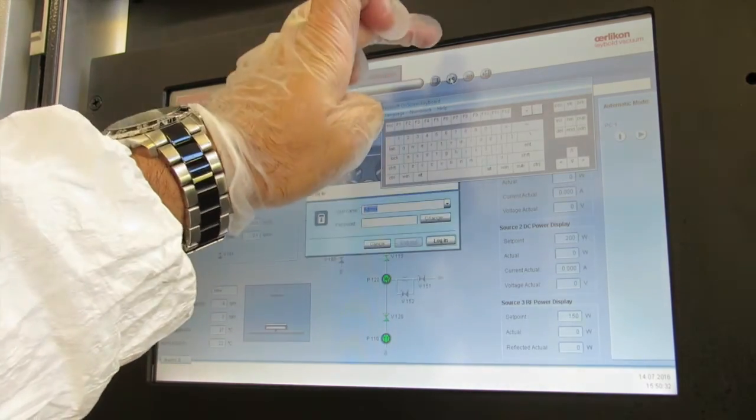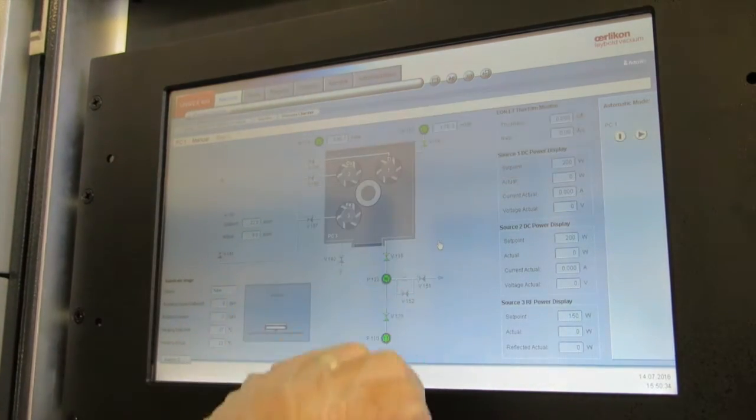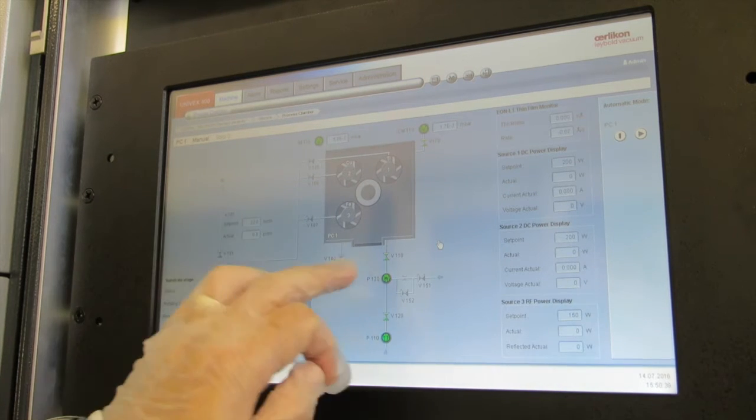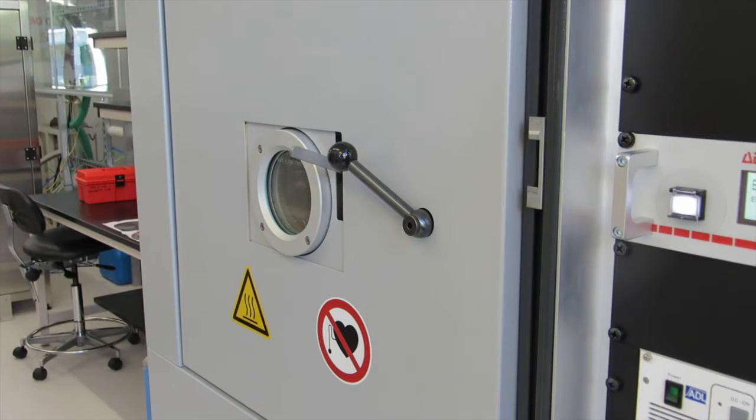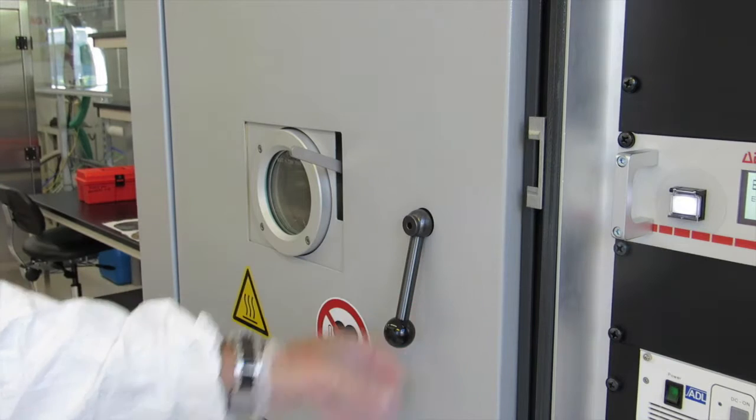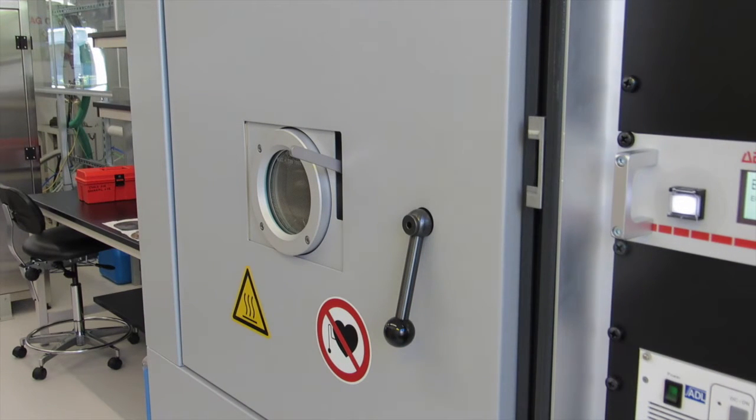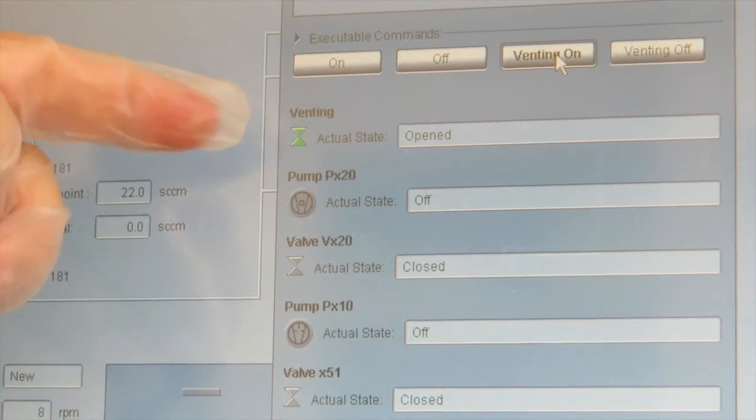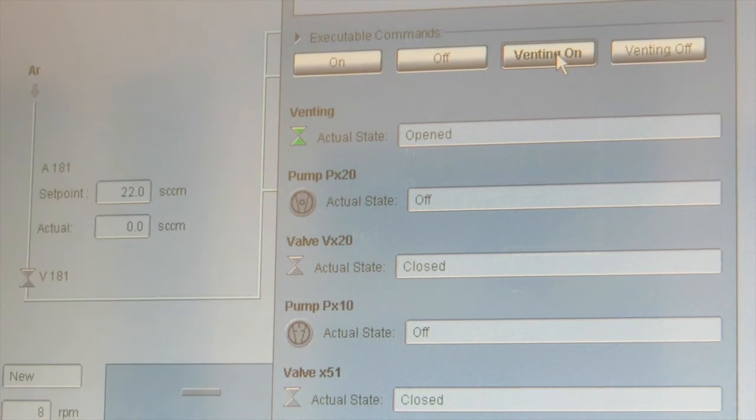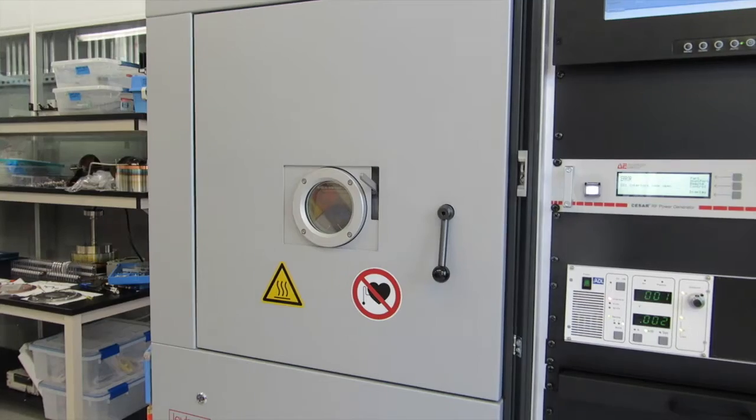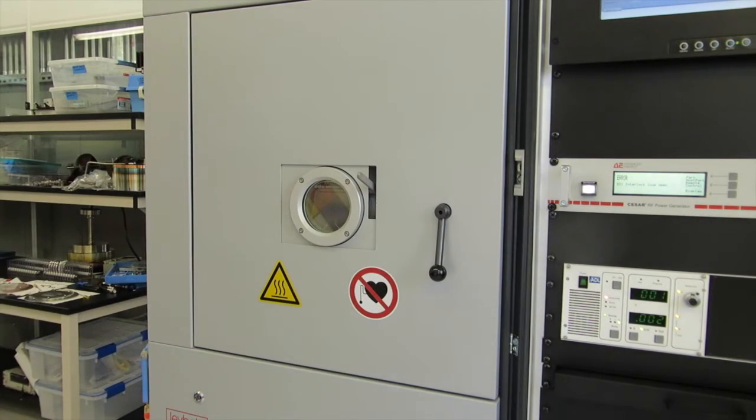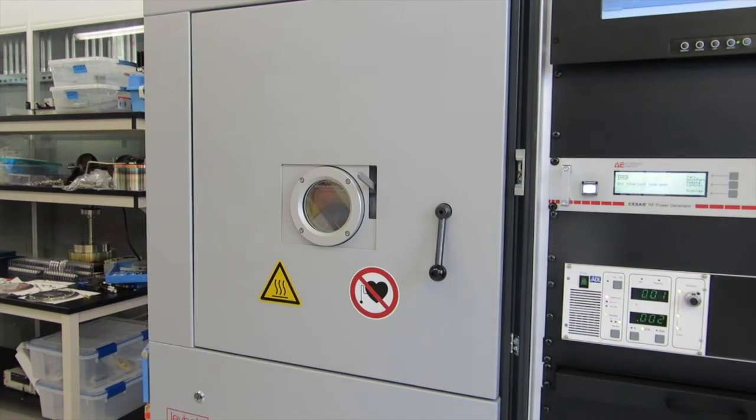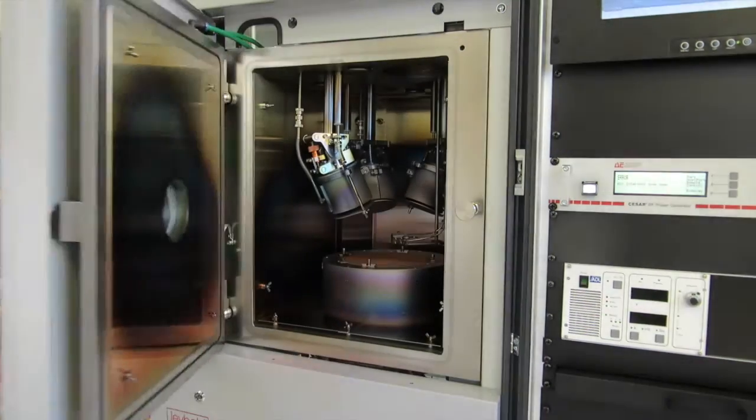Then you have to go on the touch screen of the machine, log on and go to the pumping section which is right down here and tell it to vent. While you're waiting to vent you can open this handle here that will make it so that it's easy to pull open once it's vented. It will take a little while, you can watch on the control panel and you'll see what's happening as it goes through the steps of venting. If it doesn't pull open it's not ready to open yet. When it's fully vented you can open it.